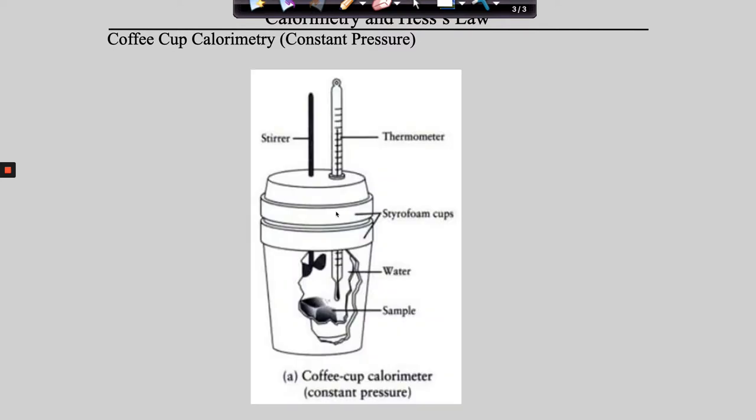So I know that you've all been wondering, since our very first day in lab, why do we have those weird coffee cups in our drawers that are surrounded in Coke cozies? Can you picture what I'm talking about in your drawers? There's like that weird foamy cup with the styrofoam cup stuck in it. No? Really? I know, we threw it away. I know, it had suffered a horrible death. But guys, all of those things are coffee cup calorimeters. So do not draw a thing, just absorb.